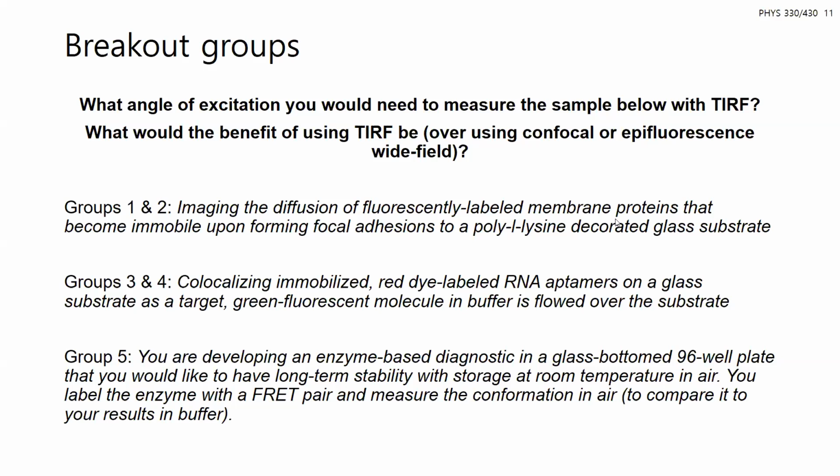And then for epifluorescence, if you're flowing the green fluorescent molecule in a buffer over the substrate, you're going to see so much background fluorescence. All the other data will probably just be drowned out. Any other comments from the other group? No, that's pretty much what we said as well.